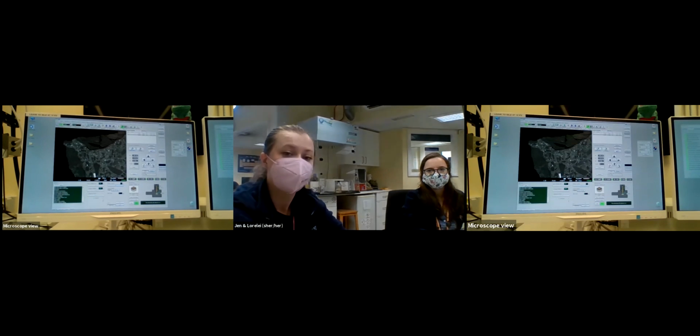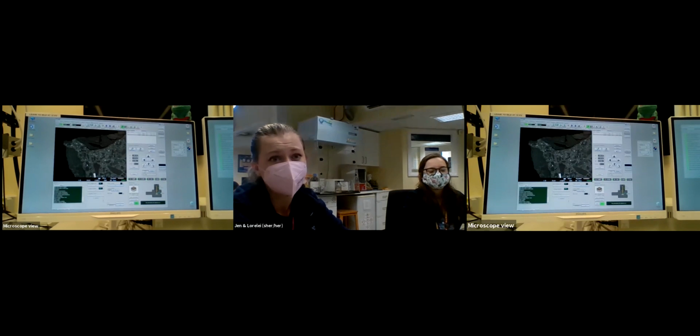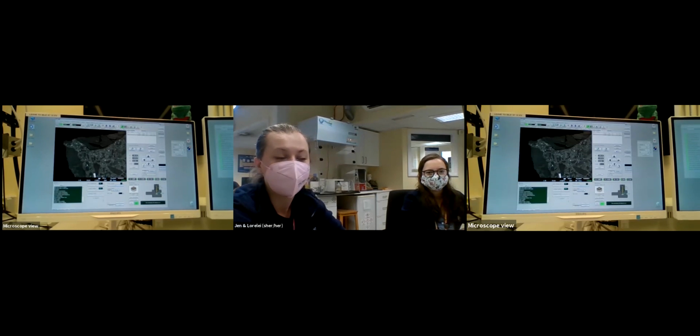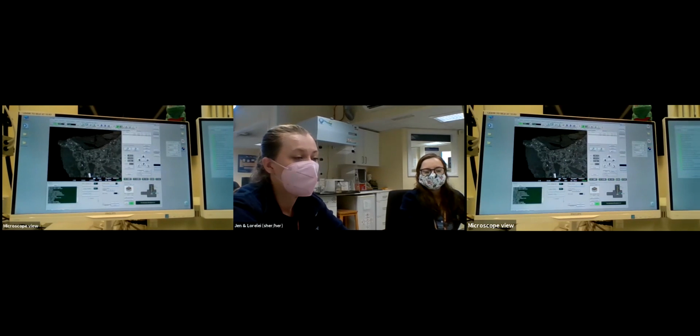From there, we'll take it over into energy dispersive spectroscopy, that's EDS. And what that does is our detector can reconstruct all that energy that's being released by the sample into spectra, into maps, into pictures, which will tell you exactly what element is present, how abundant it is, and where in the sample it is. So we could then combine those two together and get a really good compositional data set for whatever we're looking at. So for rocks, it's really useful. You can learn a lot about a rock based on what it's made from and all the little differences about what it's made from.